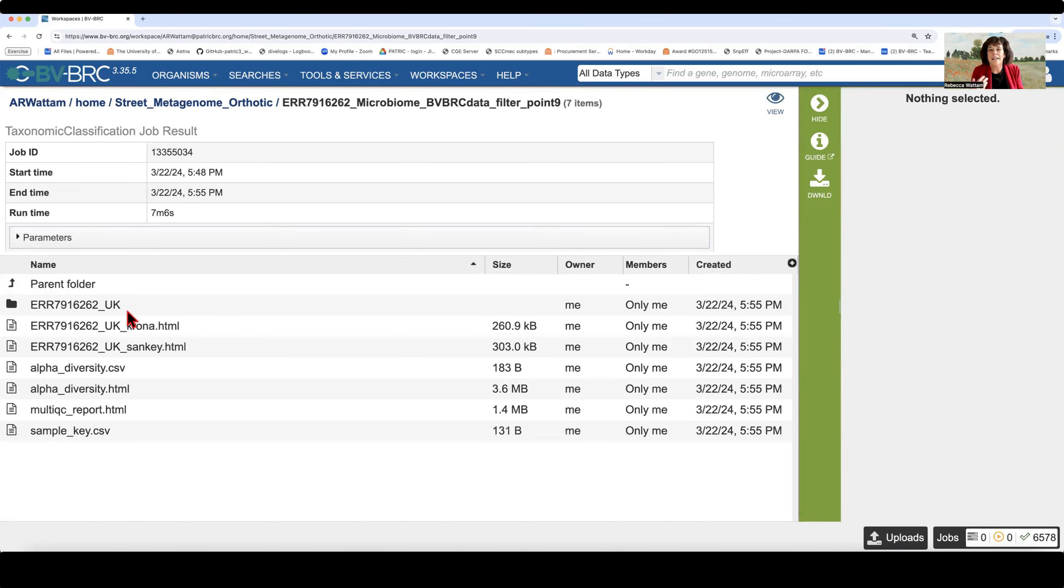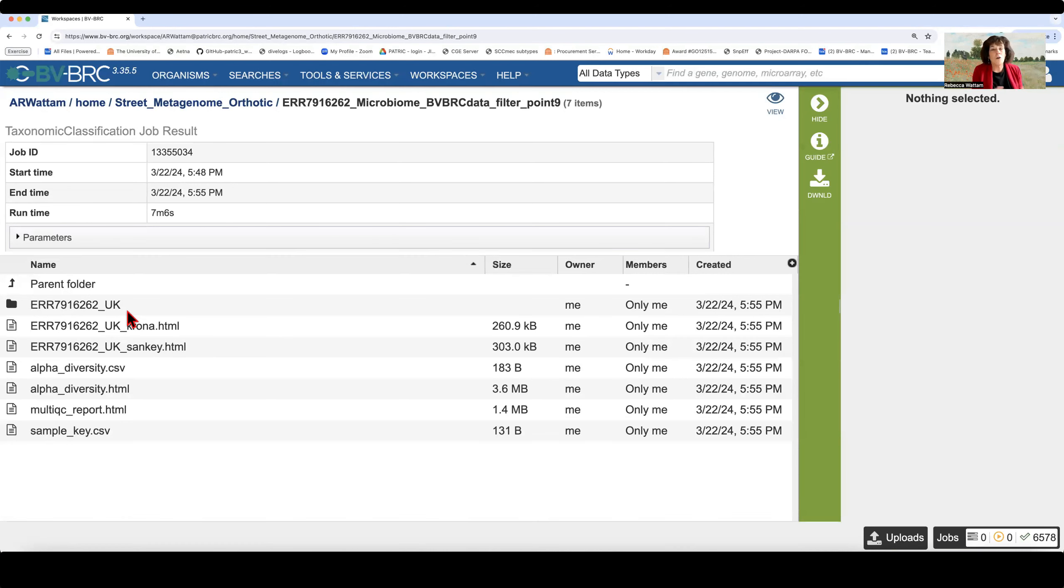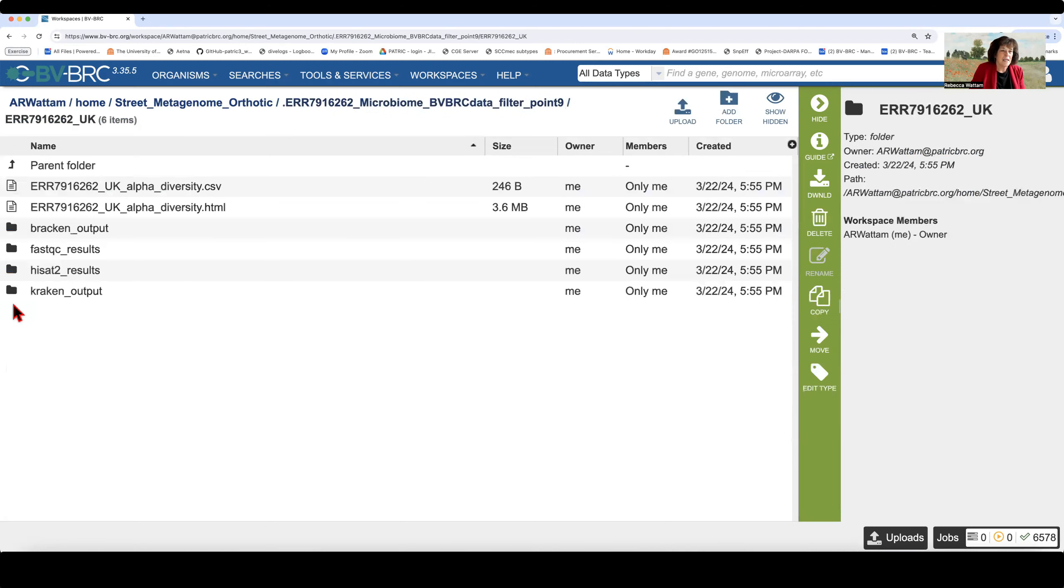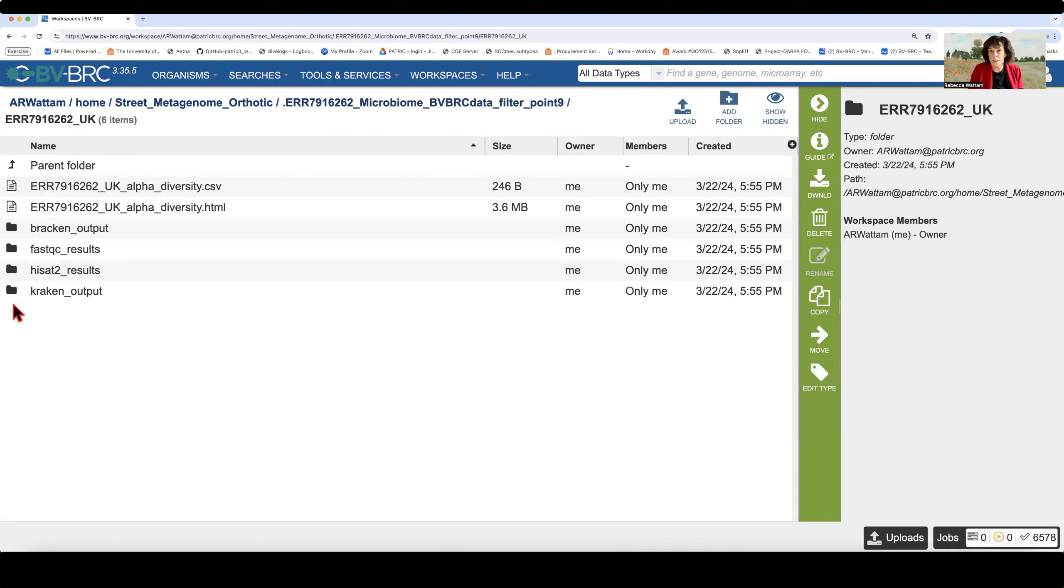And I know you've been desperate to see what's in this particular folder. Well, today all the secrets will be revealed. So let's click on this, and it opens up the results for those particular repairs that were submitted with this sample.